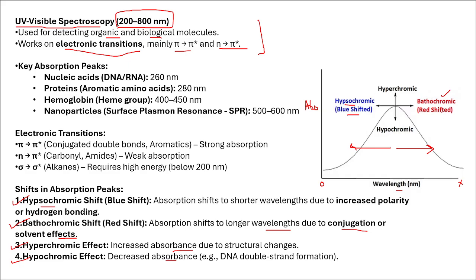So all these things apply whenever you are making nanoparticles. Suppose you are recording spectra of a free drug. First, we'll see these examples as well. Suppose at first you're recording the absorption spectra of a free drug, and it shows a sharp absorption peak somewhere around 300 nanometers.